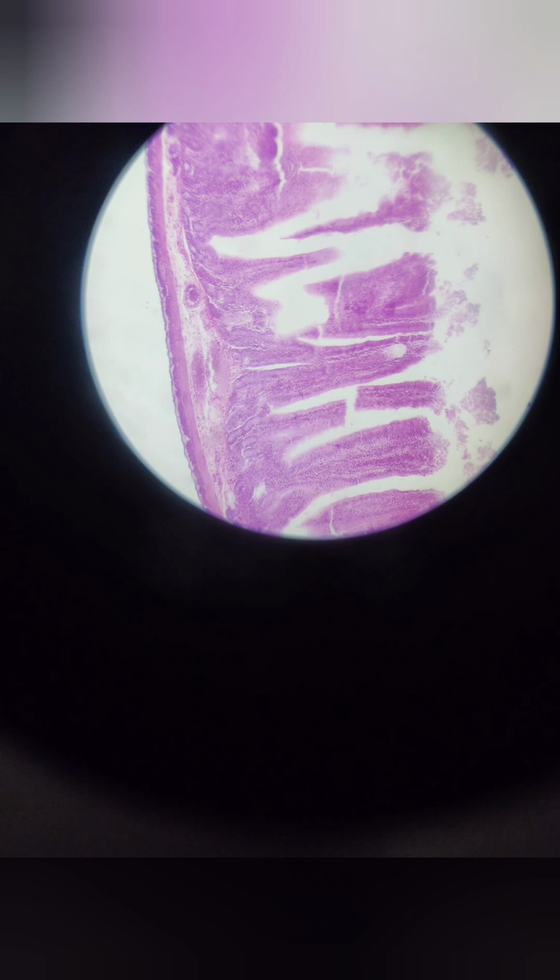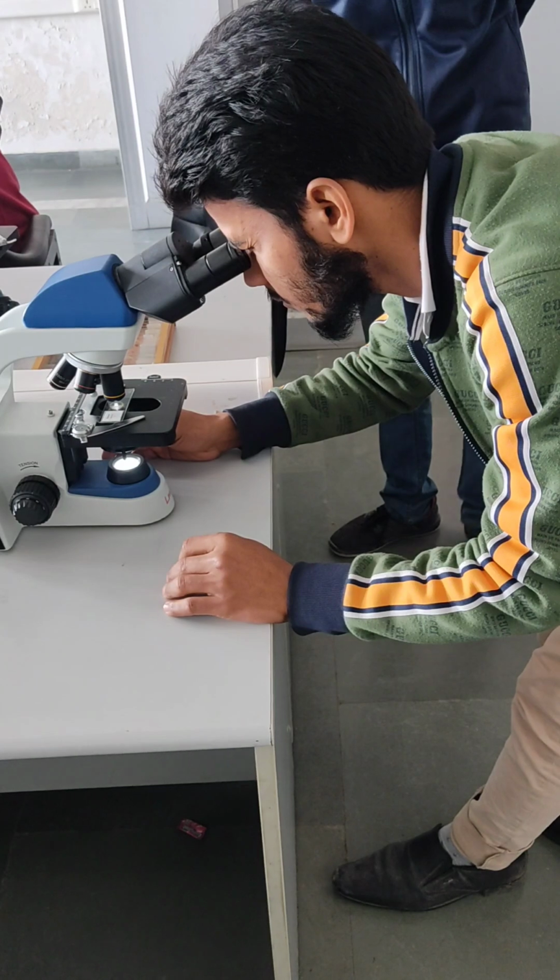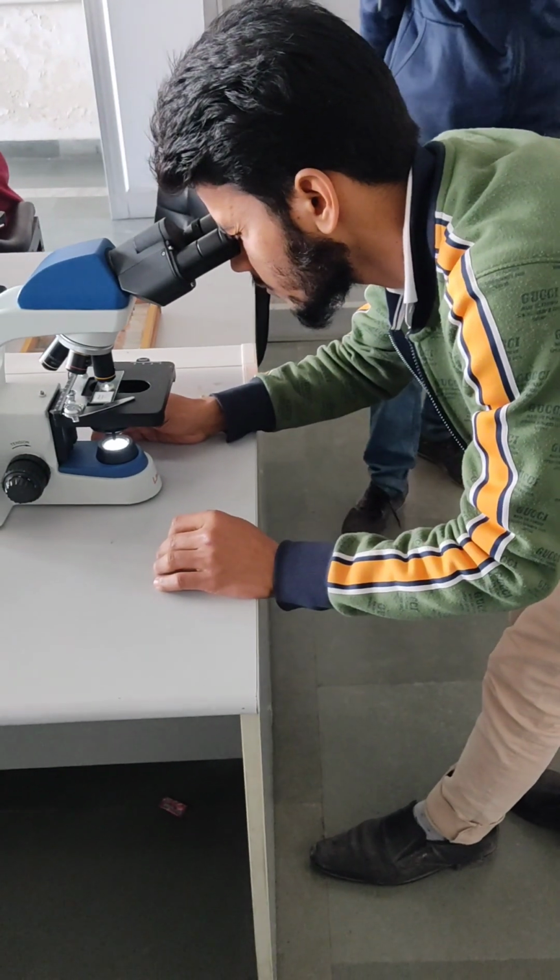And you can also adjust these things by using certain parts just like this. You can operate the microscope.